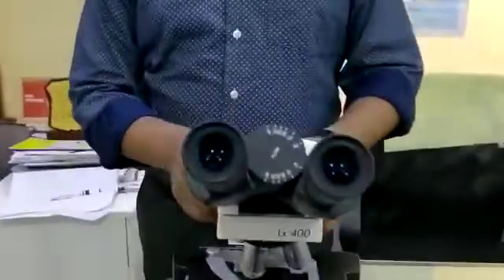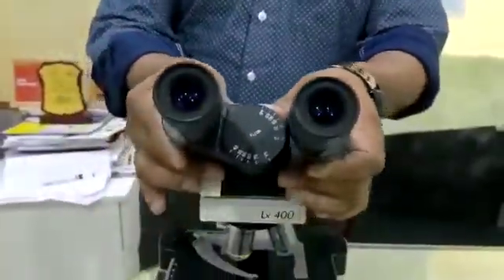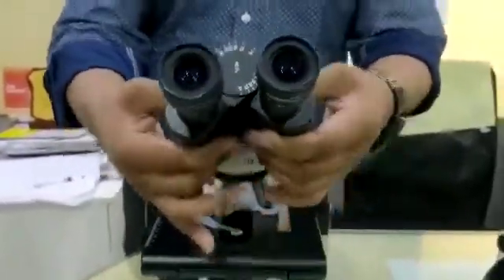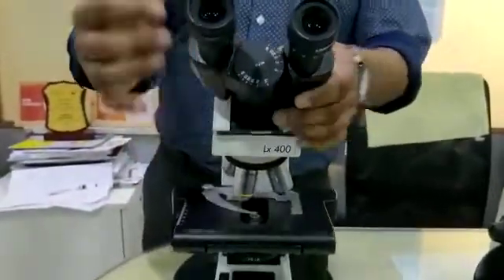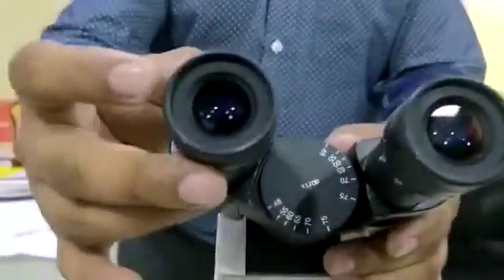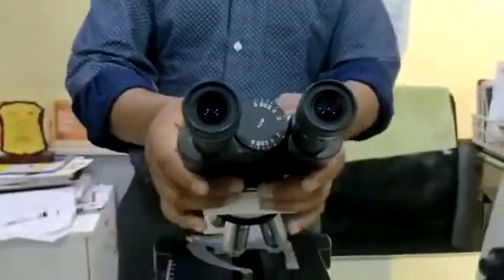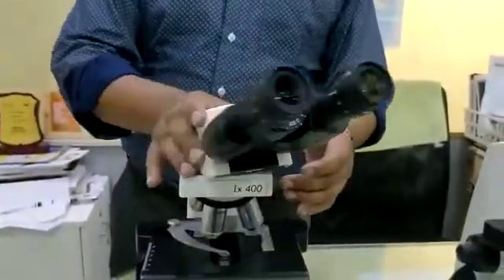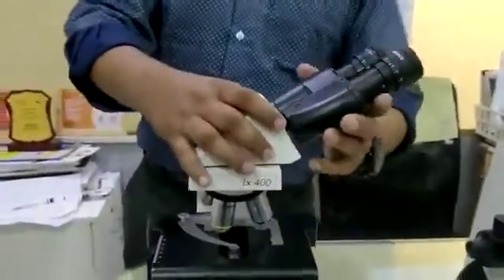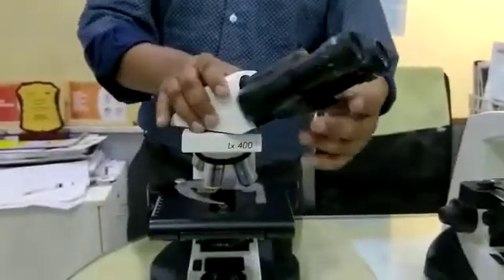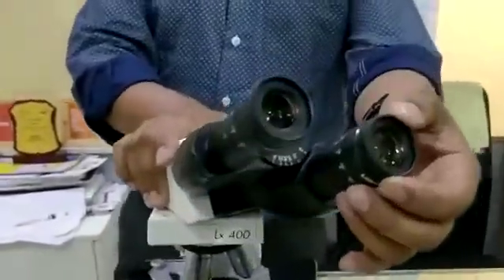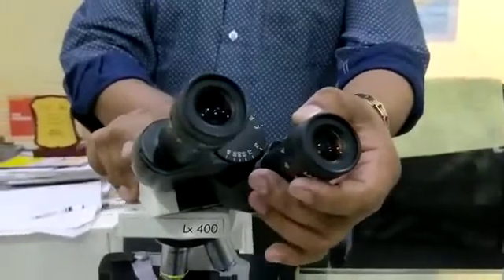Talking about the LX400 model, first the head part. The head has side-to-side movement and the field of view of the eyepieces is 20mm. In other normal microscopes the field of view is 18mm, but this is the only microscope in the market offering 20mm field of view. So you can see 2mm more area inside the microscope compared to other models.